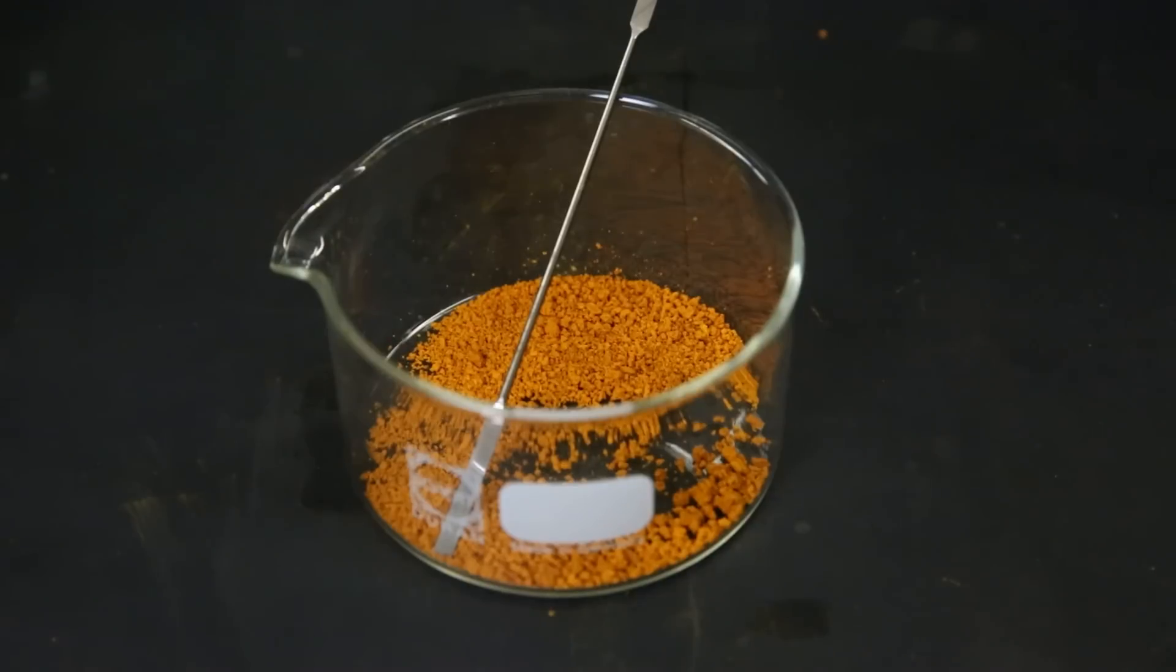Now this is the final yield of the bright orange ferrocene. To further purify it, I can do a sublimation. Since ferrocene sublimes readily, it can easily be purified that way.